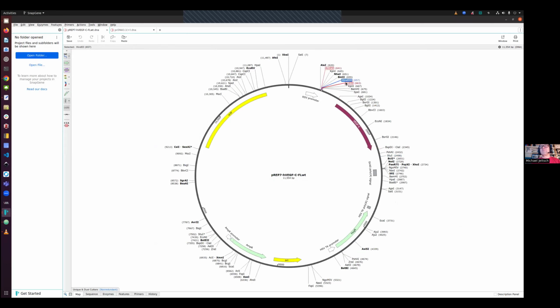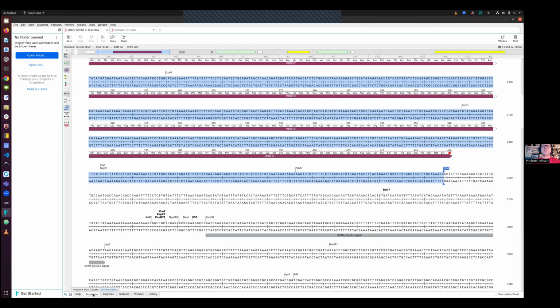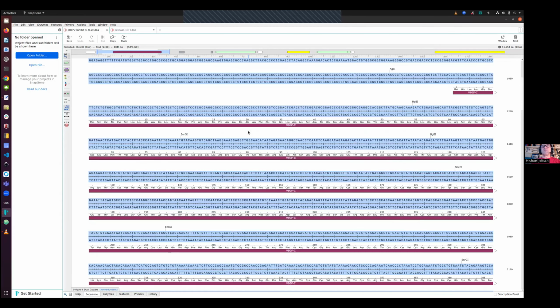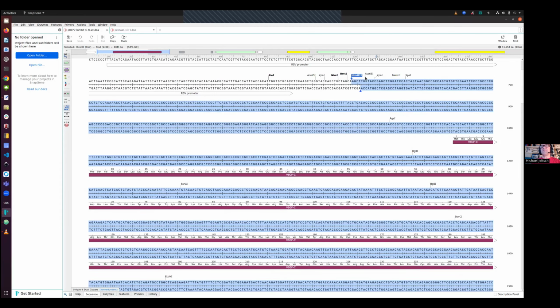And here, but let's say I select now from here to here, and I do not want to use the restriction and insert cloning. I mean, you should, but just in order to show you can do it correctly also with Control C and Control V. So if I now do this cutting with a Control C, the important thing is I really have to know where I'm cutting and where I'm inserting.